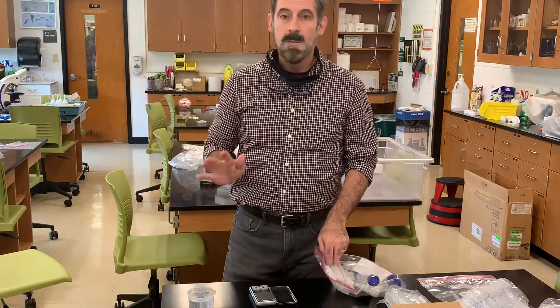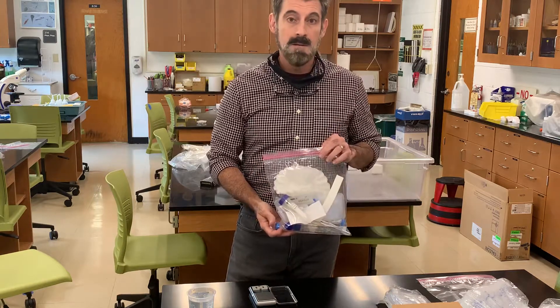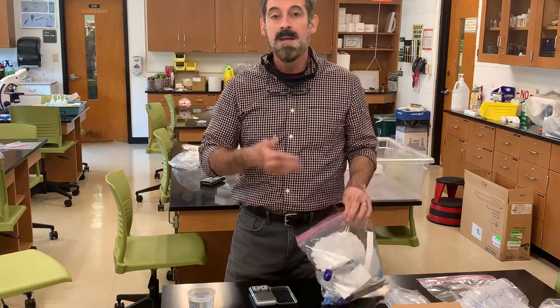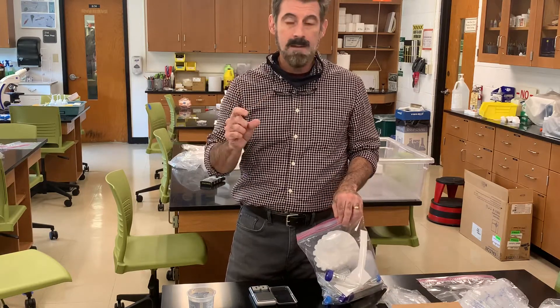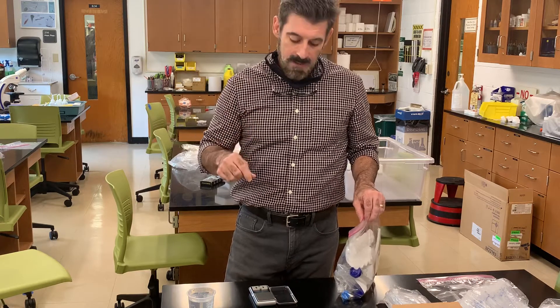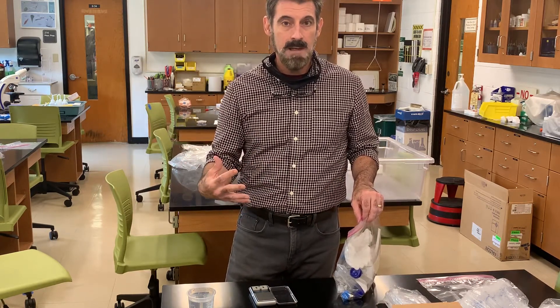Hello Bio 121 students. What I'm going to do right now, really quickly, is go over this kit that you're going to take home with you and show you what's inside it — kind of break it down quickly and show you what you'll use for each lab. Each lab that you do at home will have a separate video to show you exactly what to do.